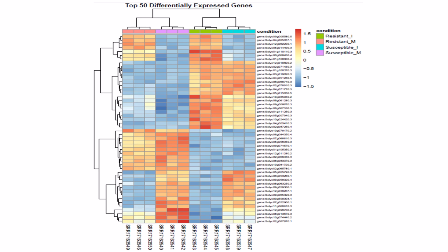So overall, the PCA, volcano plot and heat map collectively confirm the pathogen-induced significant transcriptomic alterations, leading to the identification of key candidate genes and pathways involved in the response mechanism.